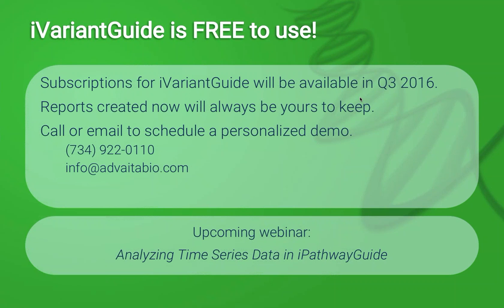It's something that many people have asked about and we've thought about. In this first release, we're limited to only the sources that we provide. However, we realize that offering personalized annotations would open up a whole world of new possibilities, so we are thinking about how to incorporate it.